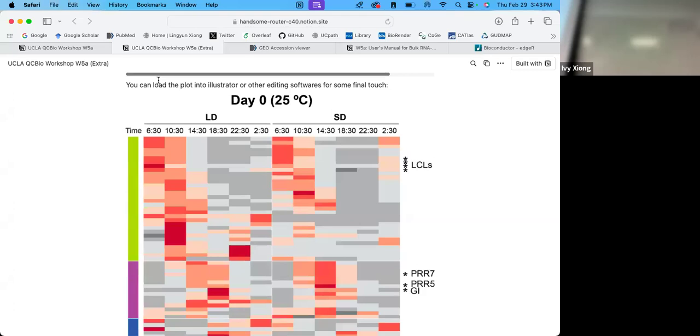Yeah, that's for yesterday. So one thing you can do is to create a common folder. I think what is going on for this folder is you have, oh, yeah, I think I have a wrong idea what's going on. So the script that I have for the pipeline asks to create a management folder. Yeah, I think skip that.